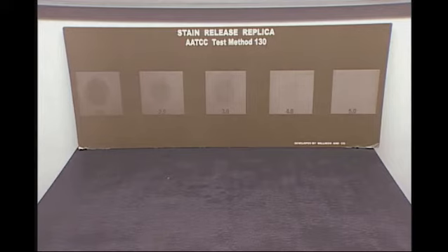In a standard grading room or area, the same standard lighting used for smoothness appearance grading is also used for stain release grading. But for grading stain release, a horizontal flat black board or table is placed in the center of the appearance viewing board underneath the standard lamp. The stain release scale is placed against the appearance mounting board, so the grading scale is viewed left to right, stain release grade 1 to grade 5.